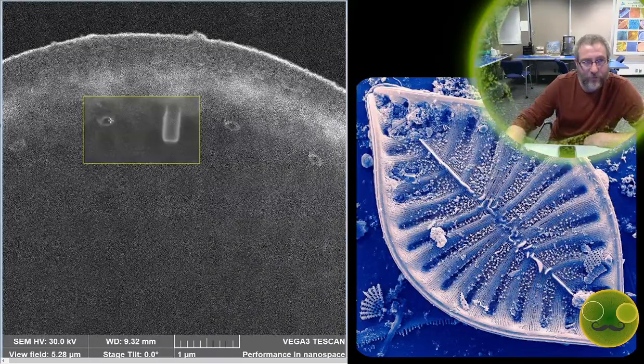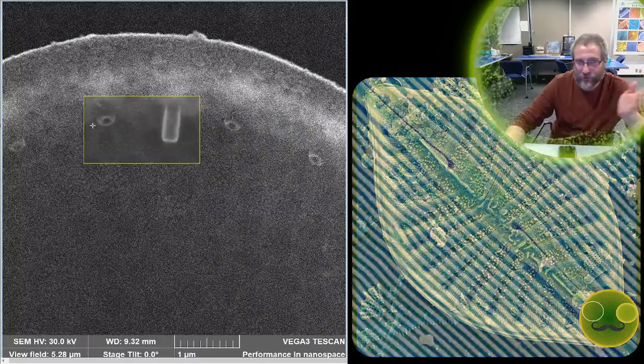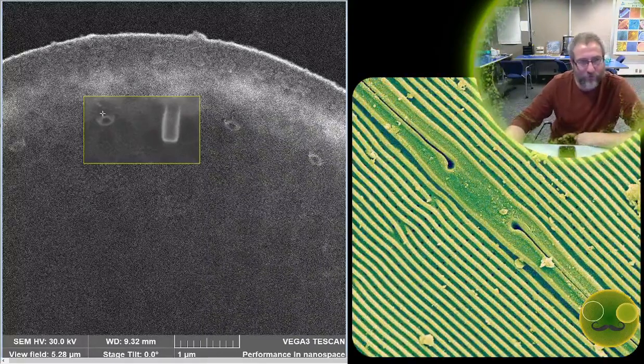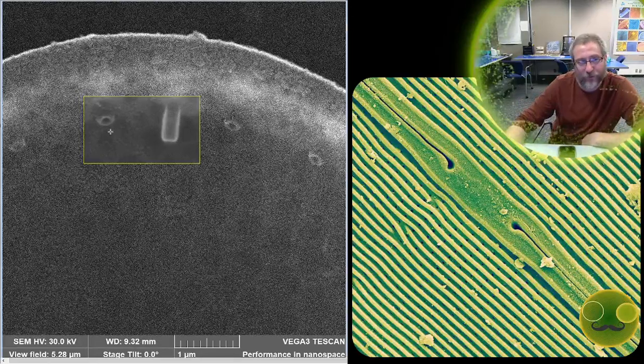And they get that name because of these little tiny struts that stick out associated with these tiny little holes. So they're always identified by having one larger hole in the middle and then a bunch of satellite holes around the outside edge. And they may have 2, 3, 4, 5, or 6. I don't think I've ever seen more than 6 little holes around the outside, but that's usually characteristic of the species. So this one has 4.